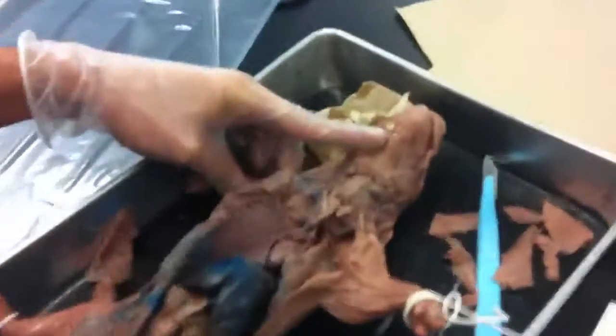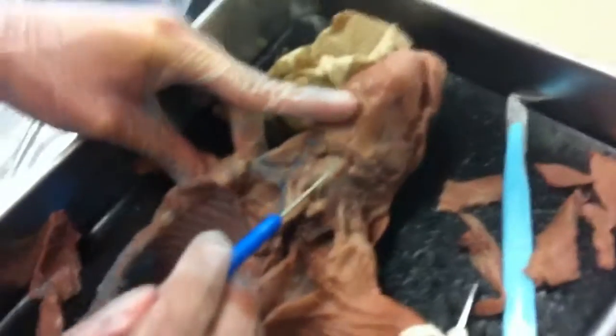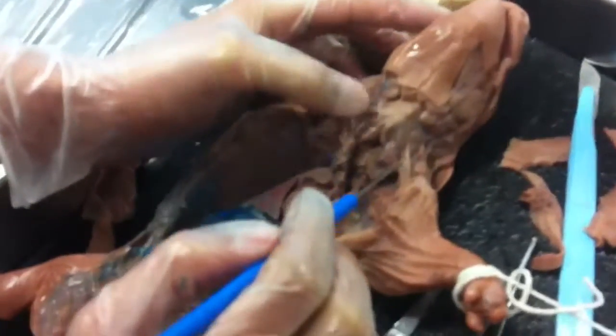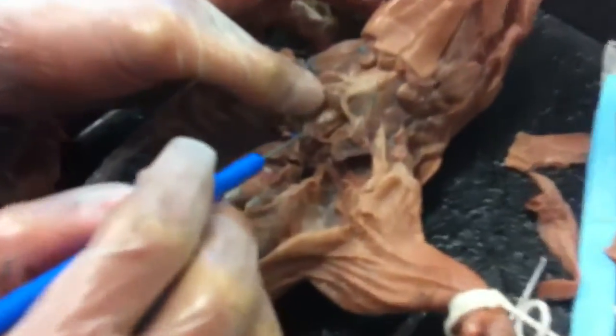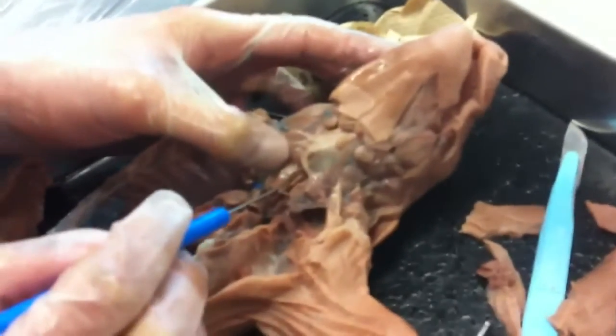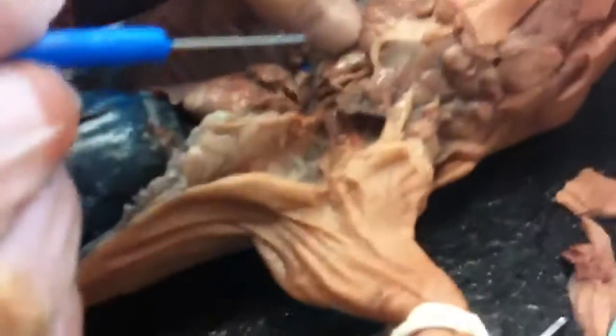Begin the larynx. The larynx is on top, and then the trachea is right here, and then the esophagus is the little thing back here with the softer part. The trachea is on top of the esophagus.